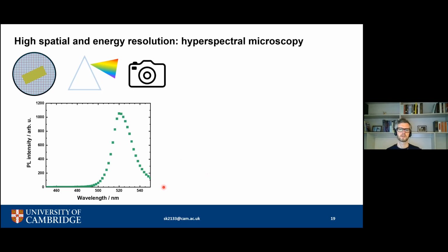So for all of these spots now, I took a microscopy image of one of these films with this large PL heterogeneity. And in a moment, I will show you a movie where we are running through these microscopy images from 450 nanometers to 550 nanometers. There will be a lot going on, so I'll let that run twice just to highlight the amount of heterogeneity in this film.